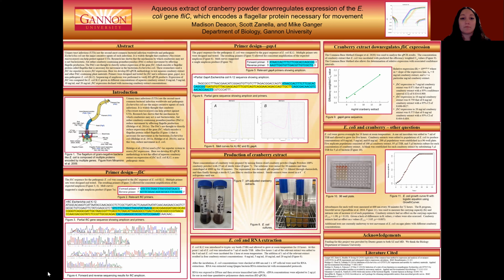And then here we've got our melt curves. We have fliC and we have GAP-A. So what this does for us is it actually tells us that all of the amplicon DNA is all melting at the same temperature, which does prove that we have from blue sequence to blue sequence right above, and nothing else that would be affecting our qPCR results.